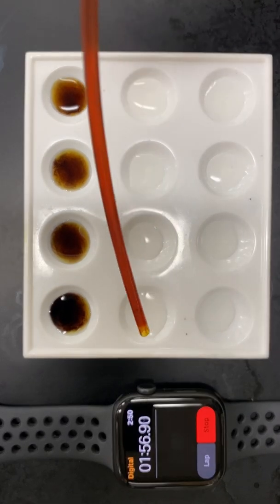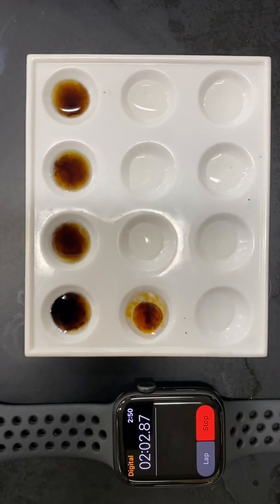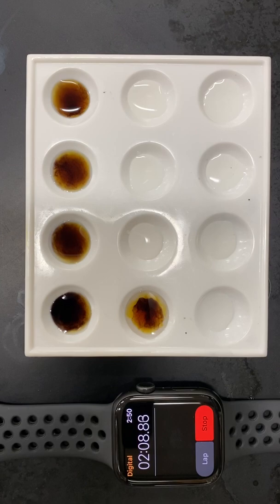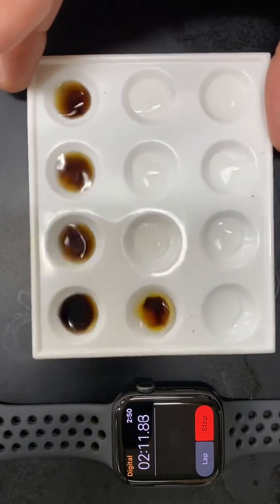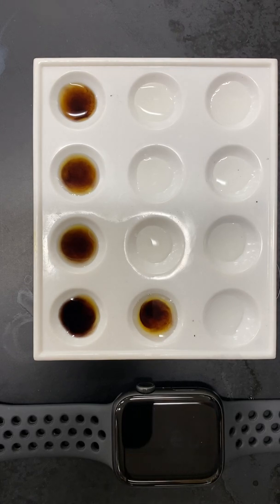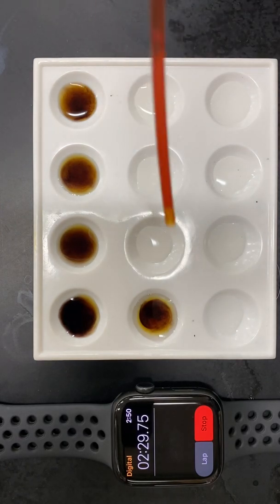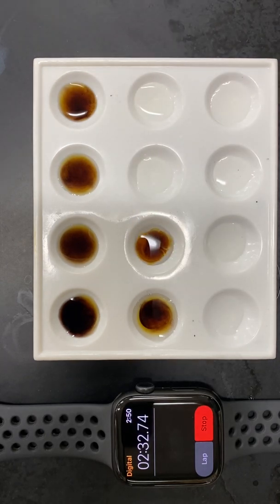Here's another drop. And it still is telling me that there is what appears to be starch present. Definitely still starch present, so I'm going to continue adding. And here we go, next one. And again, it's still pretty dark, so that tells me that there's still a lot of starch present.